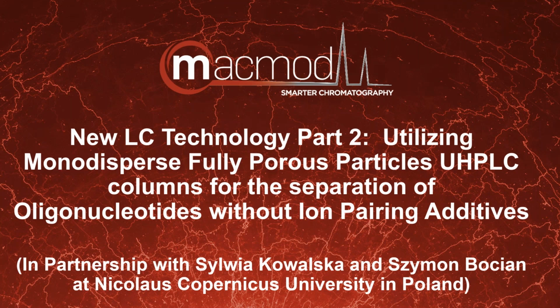MacMod really appreciates the opportunity to deliver part 2 of this webinar series. We've been a partner with the CACA committee and group for a long time, and we're looking forward to continuing that into the future. Today, we're going to do a little bit of a review of our last webinar and then go into some really exciting data on oligonucleotide separations without ion pair additives.